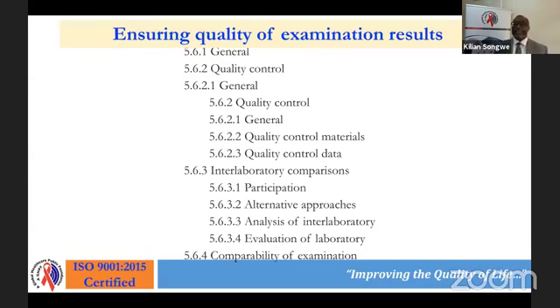So before you start testing, in the case of COVID-19, if you're going to be doing a PCR, you don't have the luxury to be able to just run controls. You're going to be using a 96 well plate, for example. And if you're going to use a 96 well plate, you can't just run a 96 well plate for 4 hours to be able to get controls. So you put on your controls and your patient samples on the same plate. And when you're on the same plate, then you now run them.